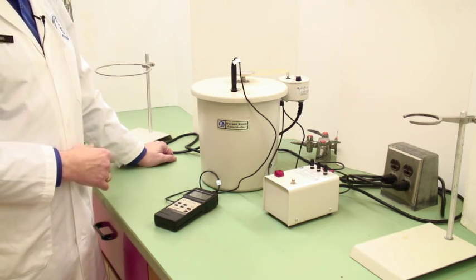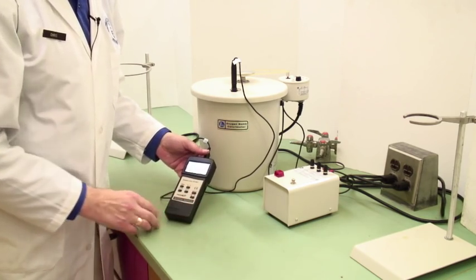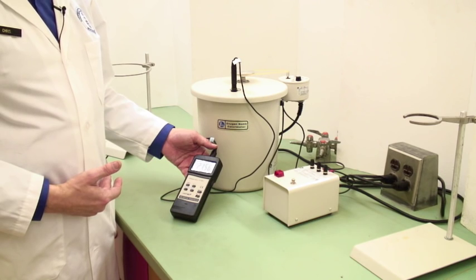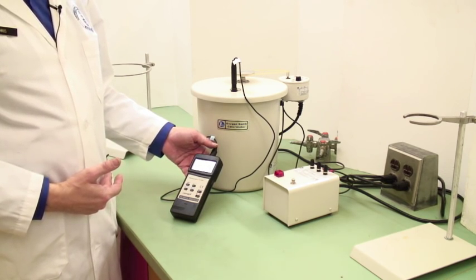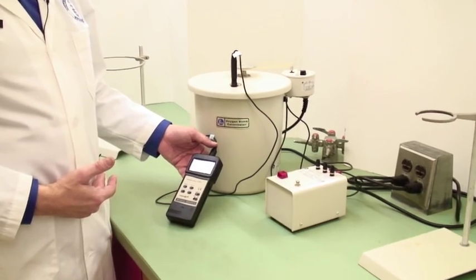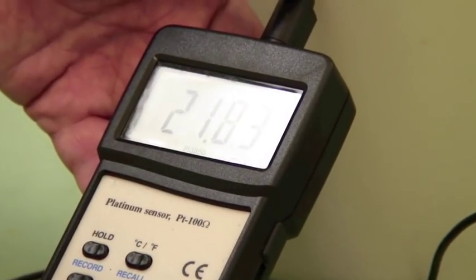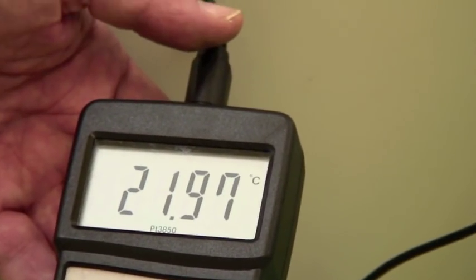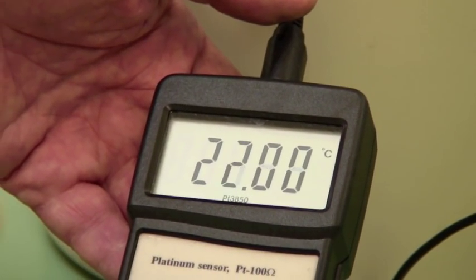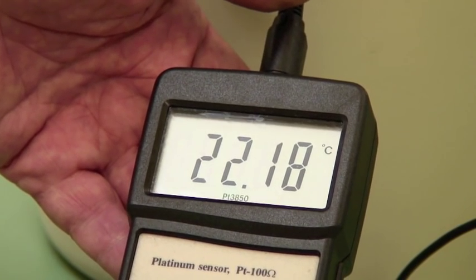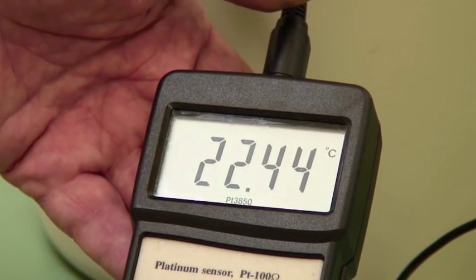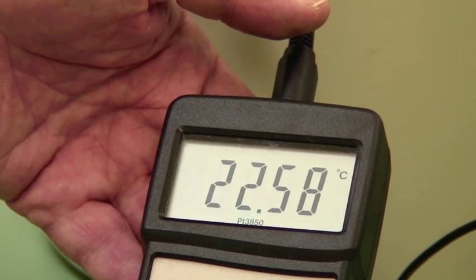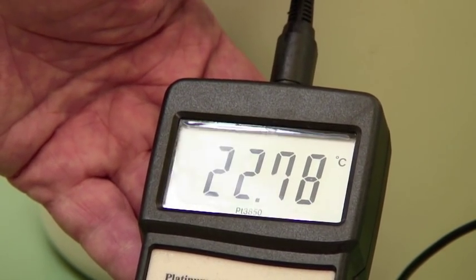Now what we do here is watch. It takes about 30 seconds for any temperature to make it through the bomb and into the water. This is starting to increase so it looks as if we had a successful firing. 21.83, 21.84, 86. So yes, the temperature is increasing. So you record this increasing temperature every 30 seconds until you get a steady point and it will start to decline. Once it has started to decline or if you've got a nice steady temperature for three or four minutes, then you can stop recording. That's probably going to be between five, seven, maybe ten minutes before you can stop. This is increasing quite rapidly now.